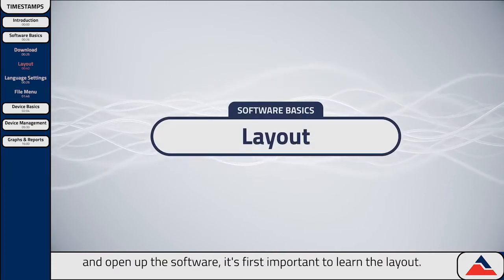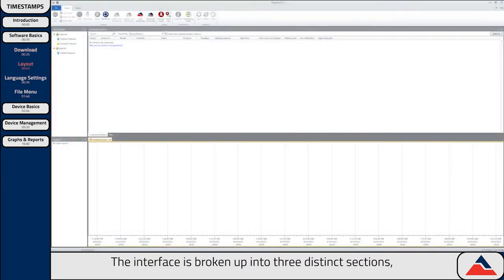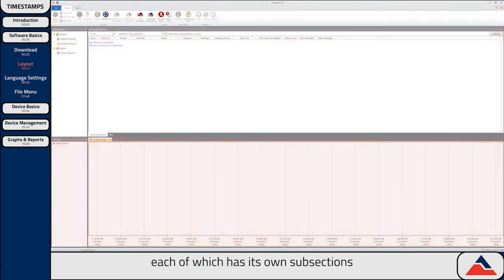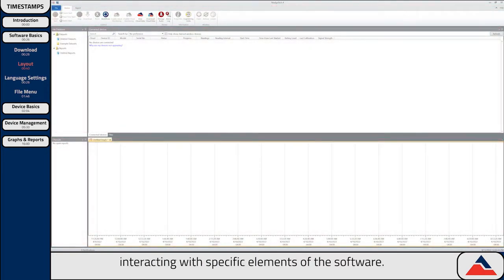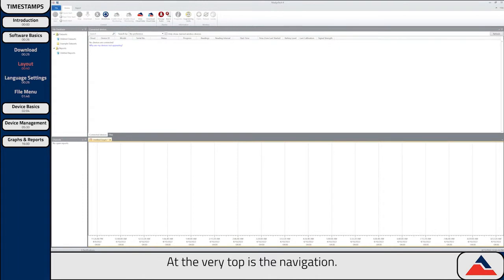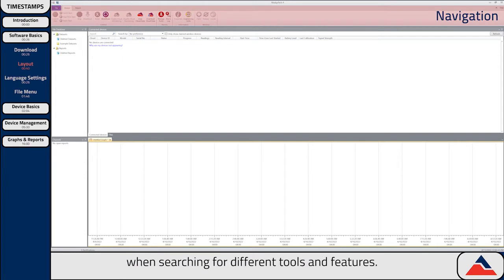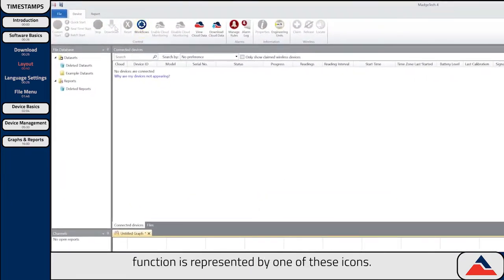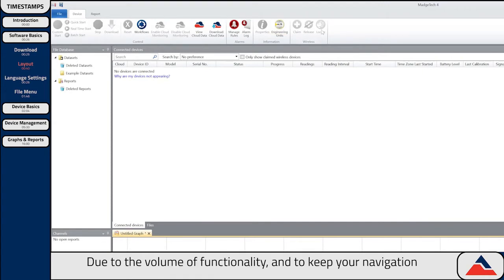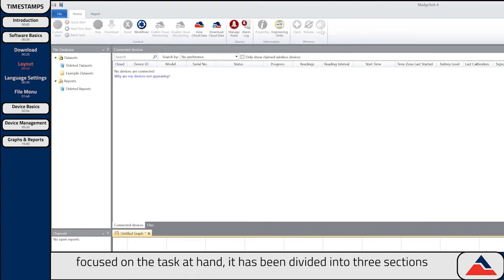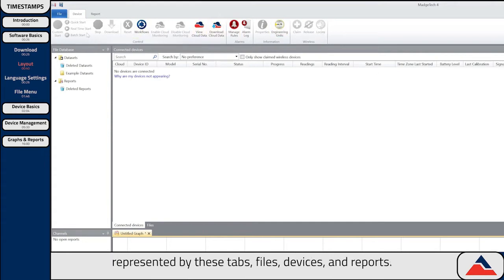Once you've installed and opened up the software, it's first important to learn the layout. The interface is broken up into three distinct sections, each of which has its own subsections and is specialized towards interacting with specific elements of the software. At the very top is the navigation, which is the key point of reference when searching for different tools and features. Just about every available function is represented by one of these icons. Due to the volume of functionality, and to keep your navigation focused on the task at hand, it has been divided into three sections represented by these tabs.